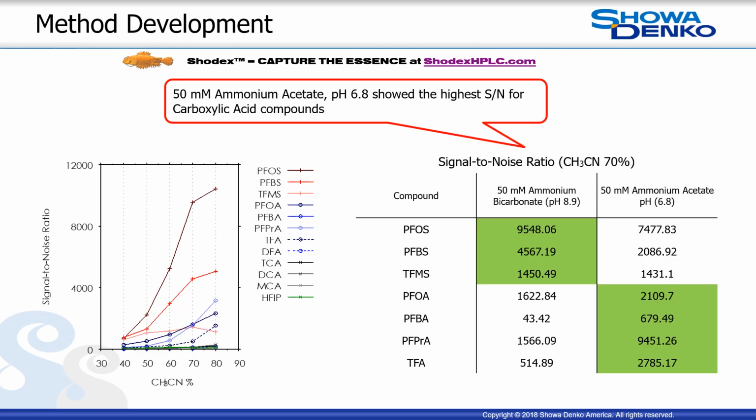The ratio of buffer to acetonitrile was adjusted to observe the highest resolution versus the lowest retention time. Moreover, final studies included observations of the strongest signal-to-noise ratios for each compound.